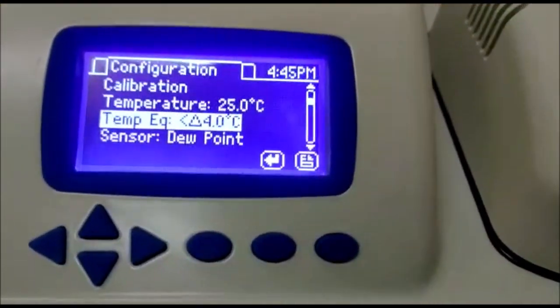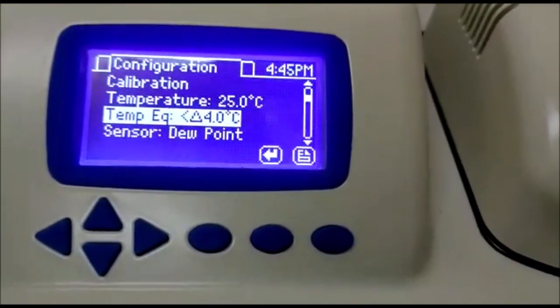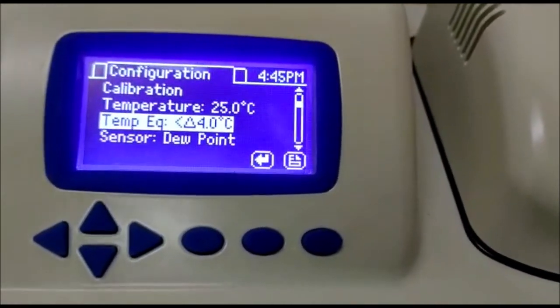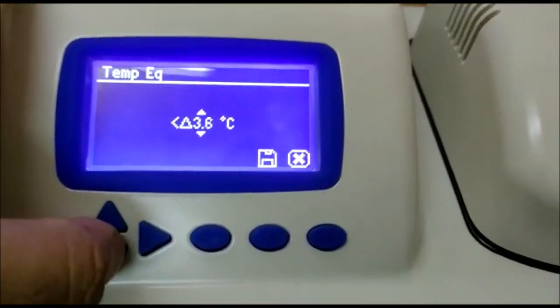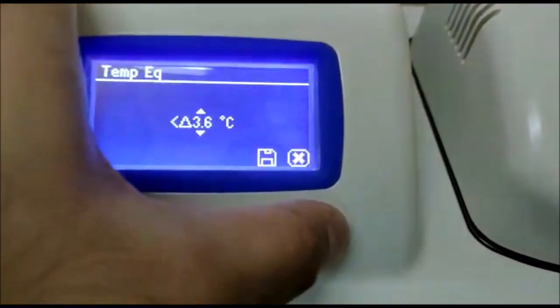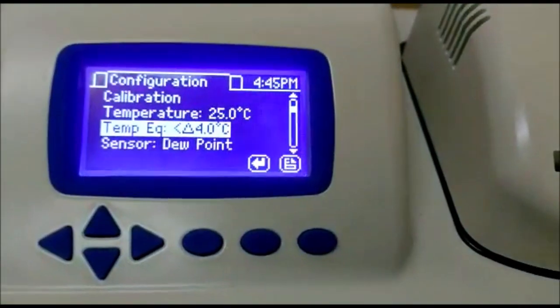Water activity is energy dependent. So higher temperature may lead to false results. You can change it also. You can go as low as 0.1 degree centigrade. But for that you have to equilibrate your sample prior testing.